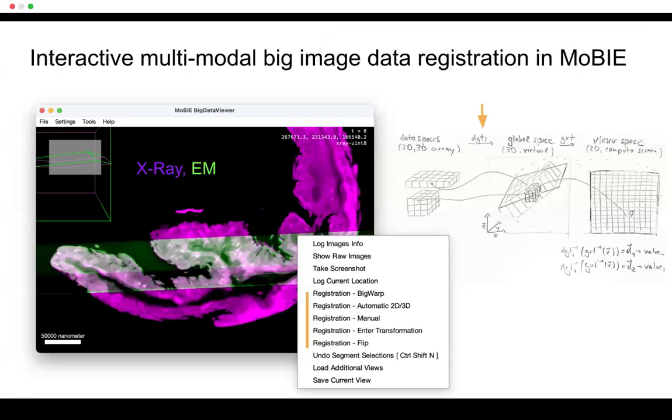Other than that, something I actually worked on in the last weeks to add some more features is another thing you can do very well in this framework is registration. So some of you might know Big Warp. Actually, if you right click here in MoBIE, you can launch Big Warp from MoBIE, which is convenient because you can then select which sources, which image sources you want to work on. And there's now some other registration modes. Here's some automatic one where we do SIFT features and also the TurboReg algorithm from ImageJ is supported. Then there's always in Big Data Viewer, the manual transformation mode where you can select one image and then move it around freely. Then we have here something where you can just enter an affine transformation that you might know from some other software to apply it. And here something where you can just flip the data around one axis, which is something we just needed.